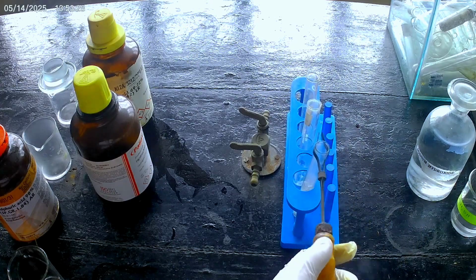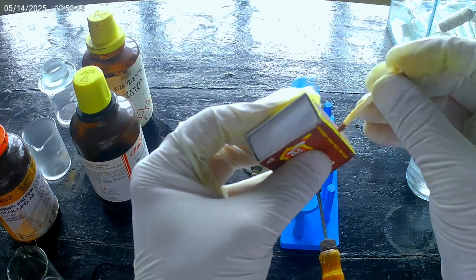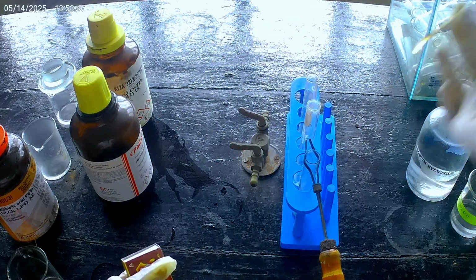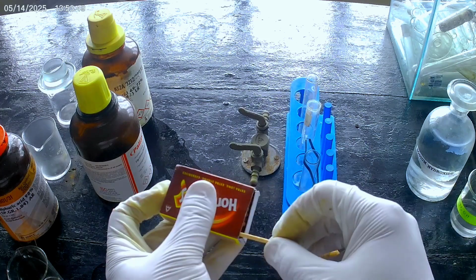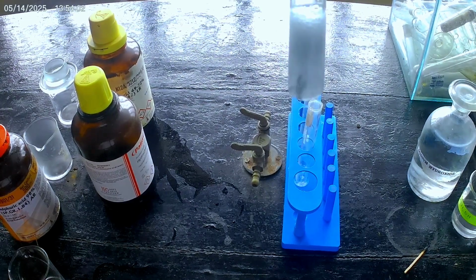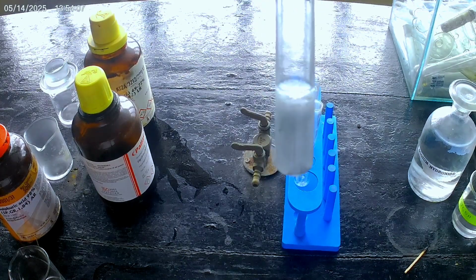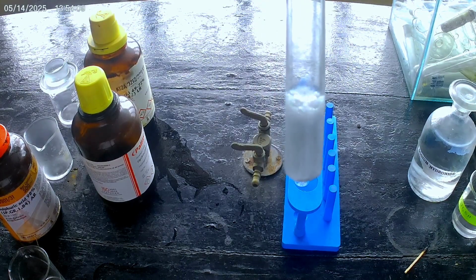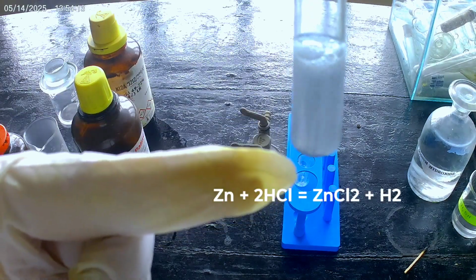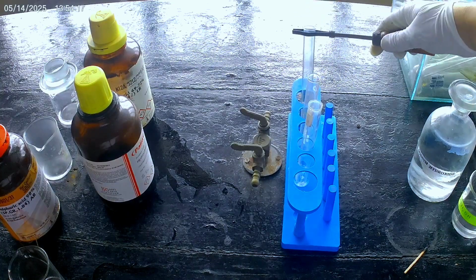Now let us see which gas it produces. So whether this gas produced will make the sound of popping. As you can hear, that's a popping sound. So now you will notice when the metal zinc reacts with hydrochloric acid, it produces salt and hydrogen gas with a popping sound. So you'll notice the zinc metal completely dissolves in the hydrochloric acid. So we will keep this for further observation.